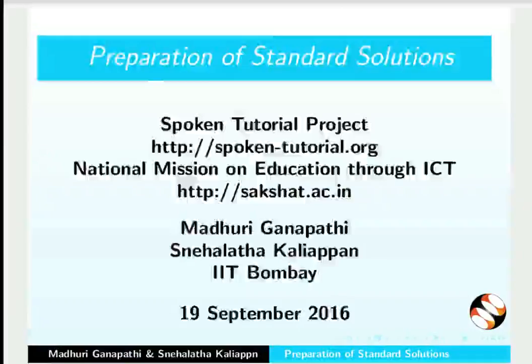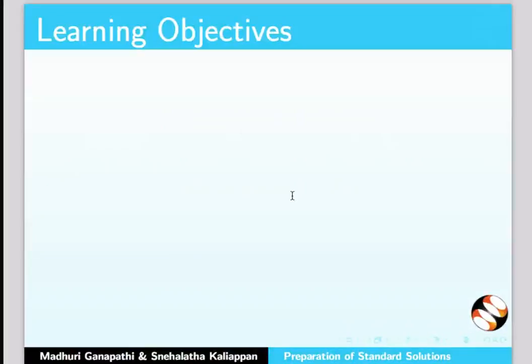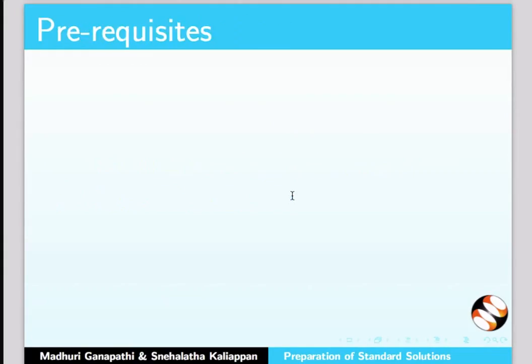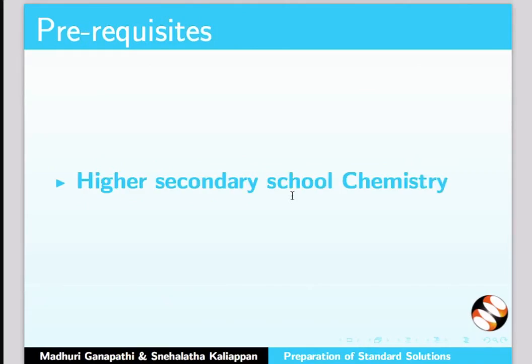Welcome to the spoken tutorial on preparation of standard solutions. In this tutorial, we will learn to prepare standard solution of 1 molar sodium chloride. To follow this tutorial, you should be familiar with higher secondary school chemistry.